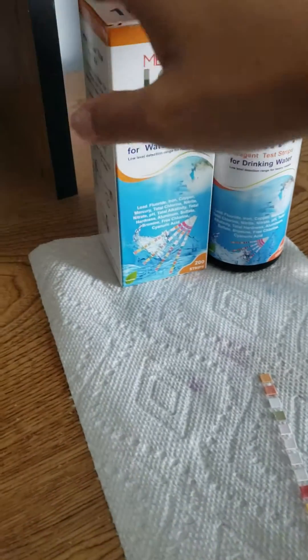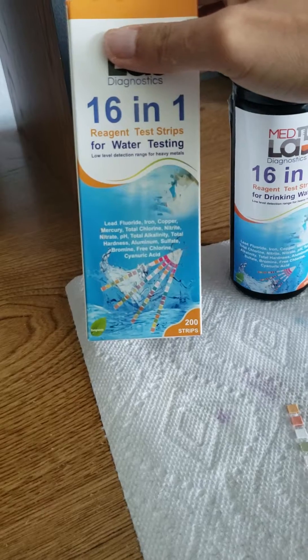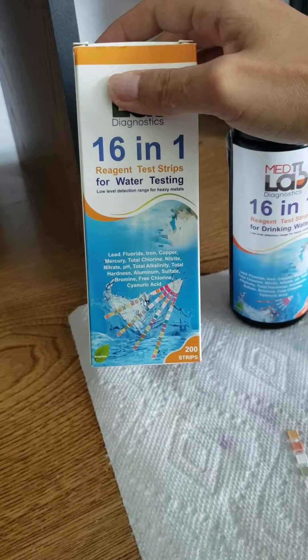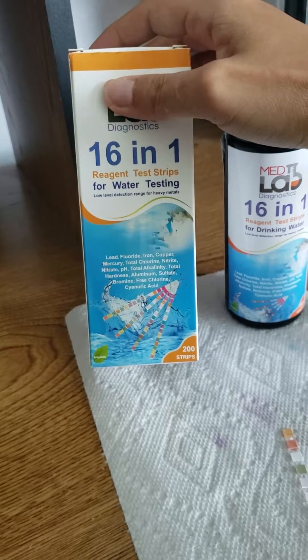The parameters that we are testing for in these strips are lead, fluoride, iron, copper, mercury, total chlorine, nitrite, nitrate, pH, total alkalinity, total hardness, aluminum, sulfate, bromine, free chlorine, and cyanuric acid.